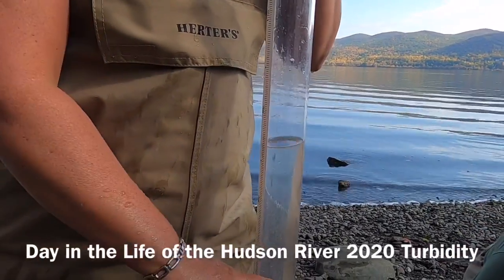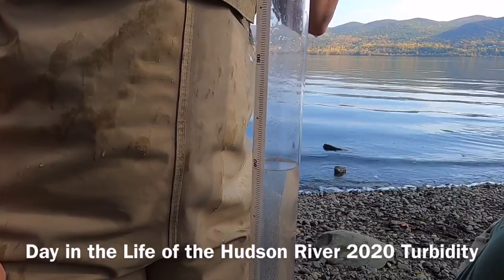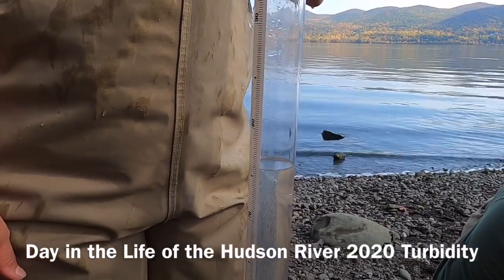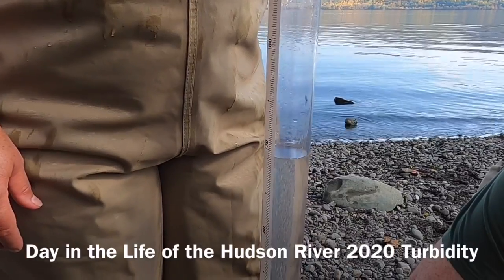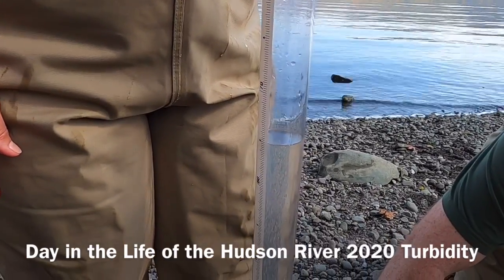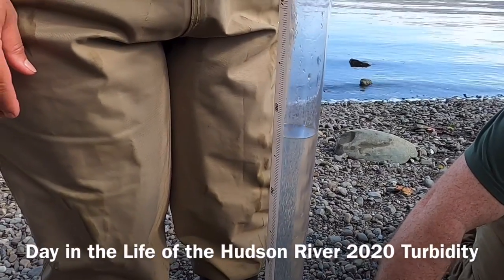So even though we're all the way down here somewhere, I still can't see any distinctions. See the water receding in the tube. We're not quite there yet.